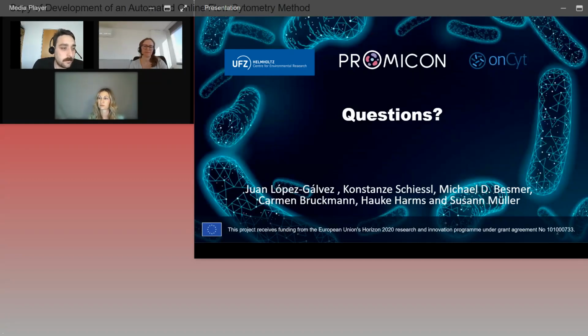Very good. Thank you both. Now we have a question asking, why do you use DAPI? Could this work with other dyes? Well, in general, you can use other dyes. I mean, the online protocol is very versatile. You can program it in other ways. We've, for example, worked with dyes like SYBR Green. Likewise, the CytoFLEX has many channels, so you could use other dyes. I think DAPI brings a lot of benefits. Maybe, Juan, you can talk about that because your group really focused on DAPI for this specific application.